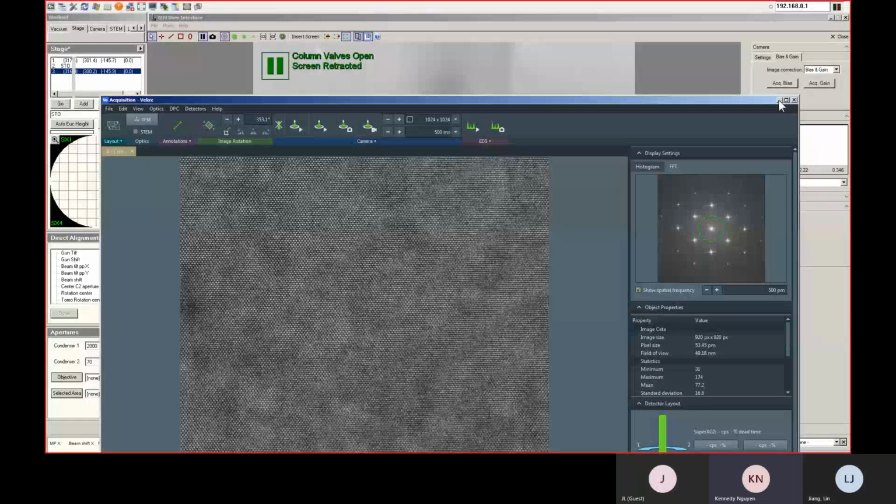Most of the particles that we normally look at are not pure single crystal. Most of the time it's nanoparticles and stuff, and I know usually they drift a lot. Could we do the filtering for that, or because they're not periodic?